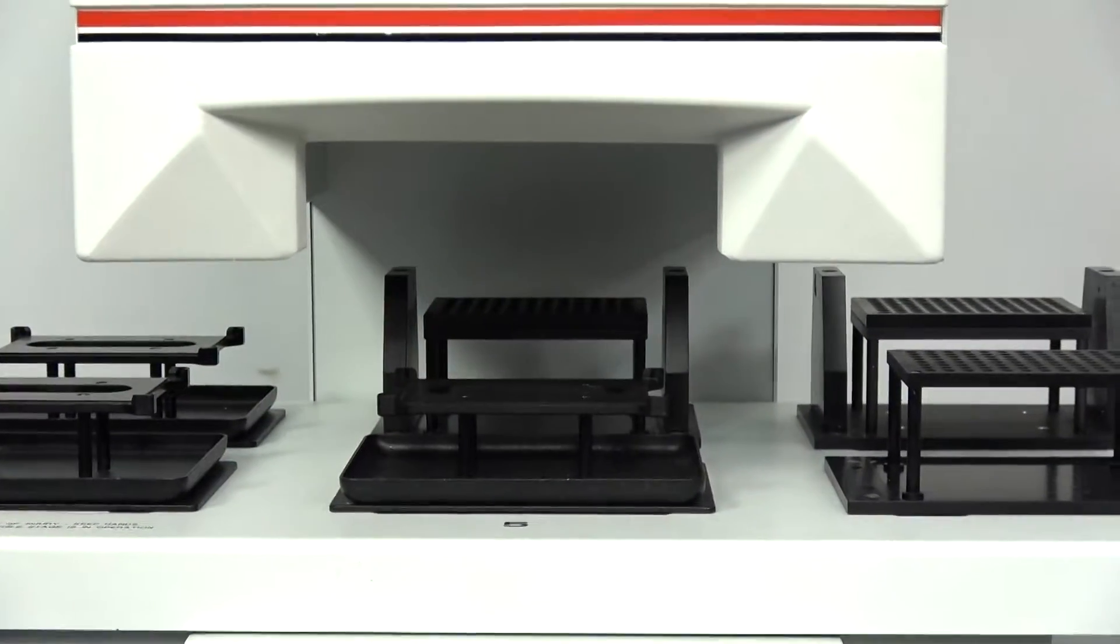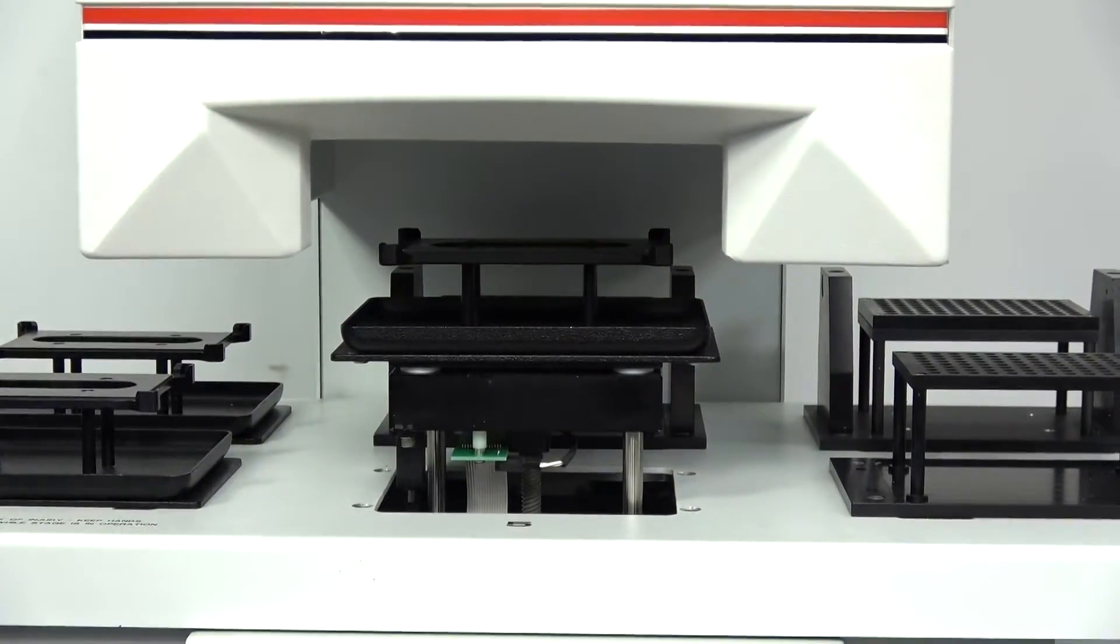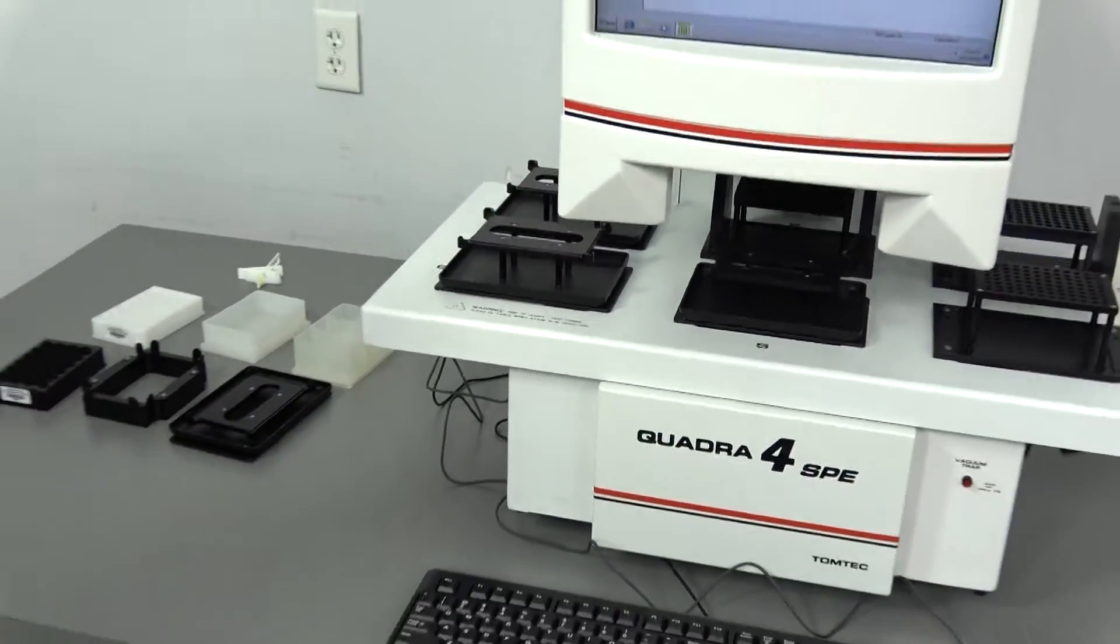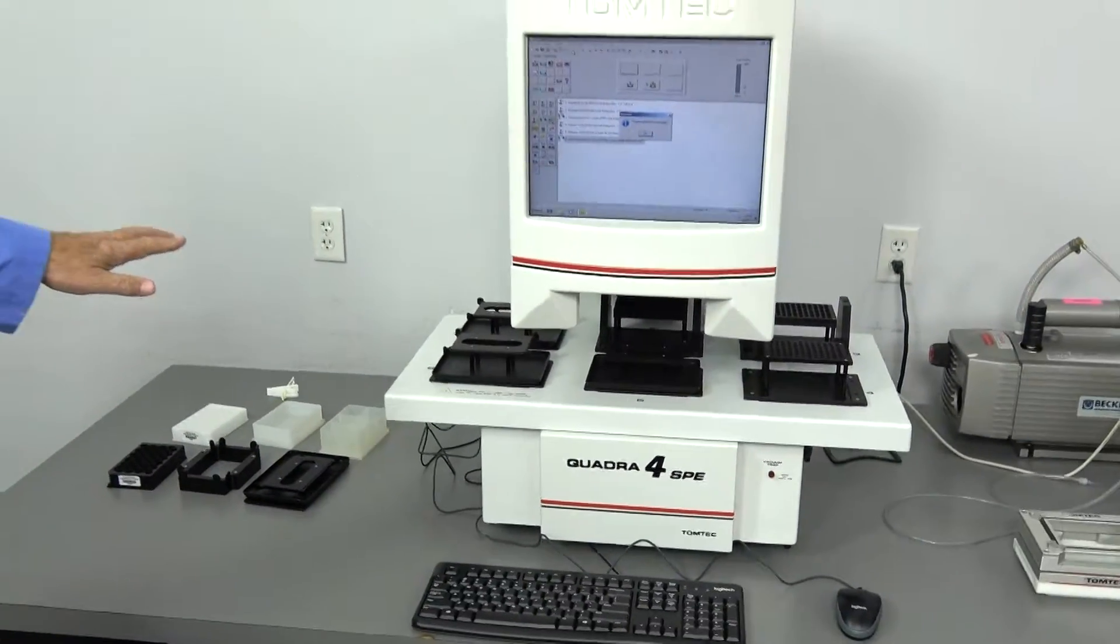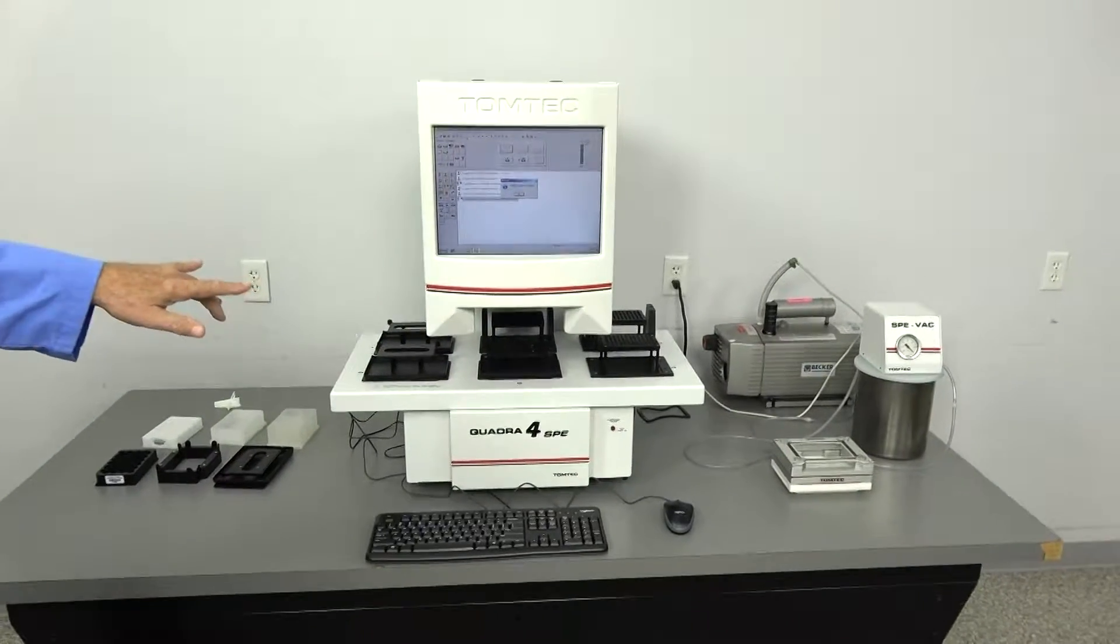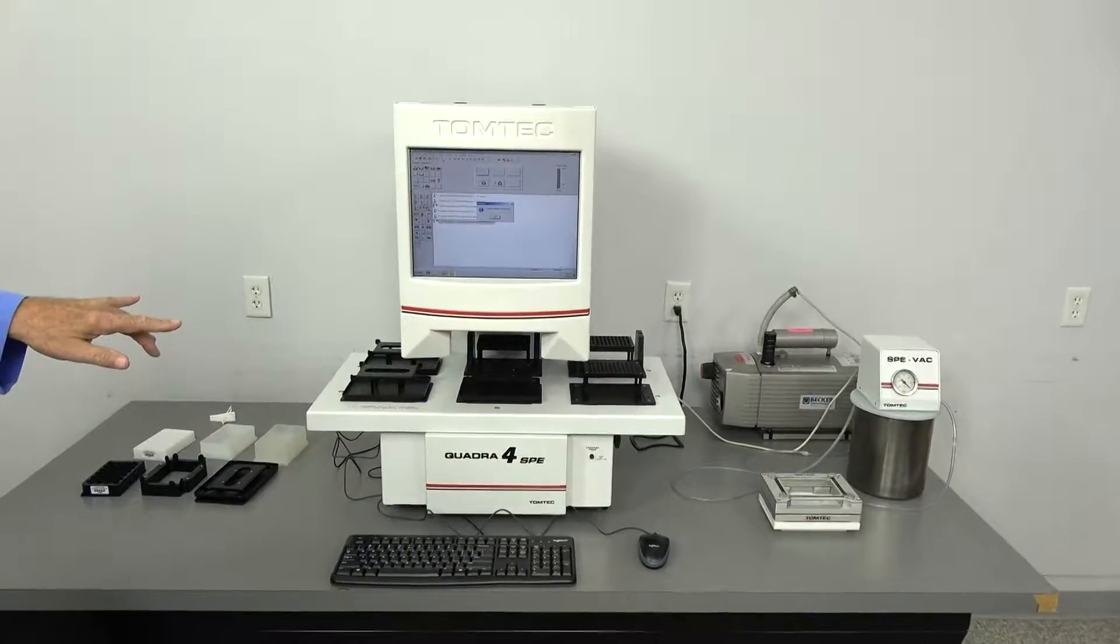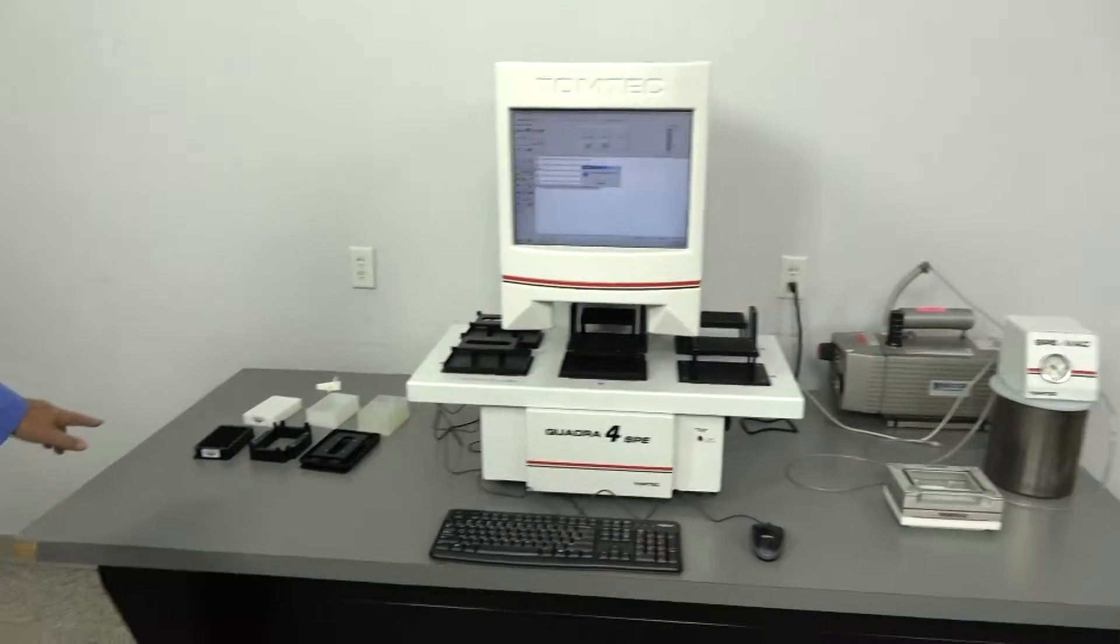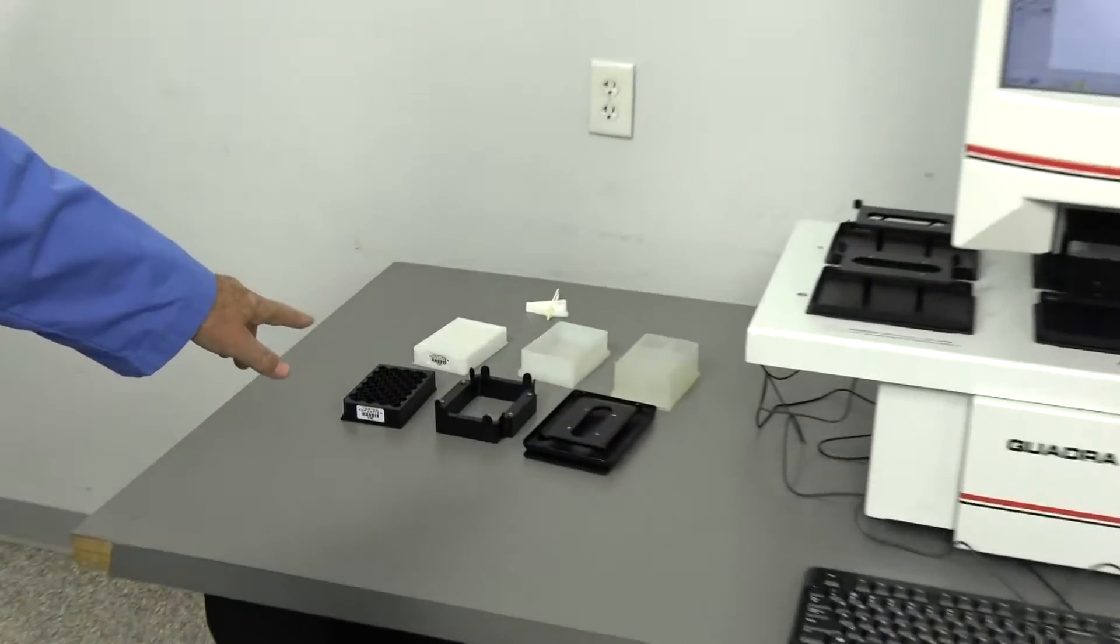It is going to be featured with the starter set of nests, which are the three standard height nests, inch and a half tall, three tip nests, then also formatters and liquid handlers here.